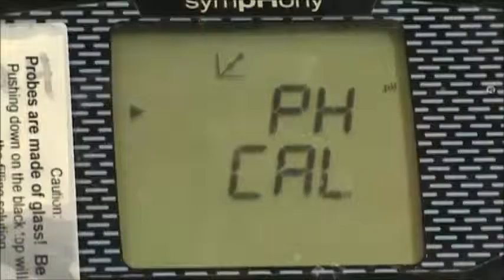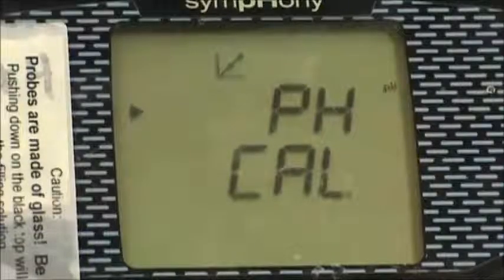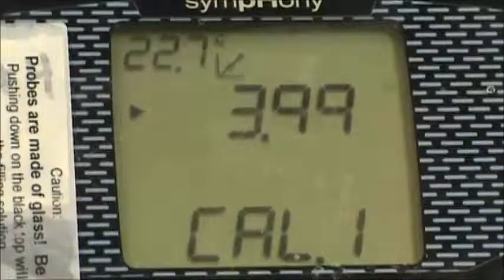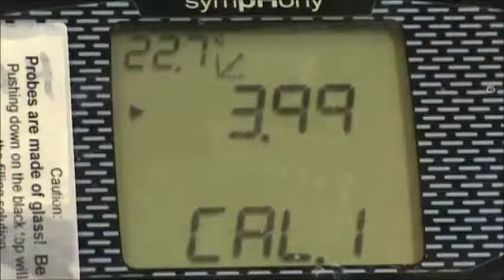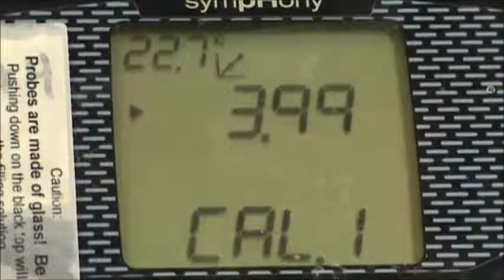To go into calibration mode, press the Cal button. pH Cal should appear on the screen. Cal 1 should then appear, and the instrument should automatically read the correct pH of the buffer solution.